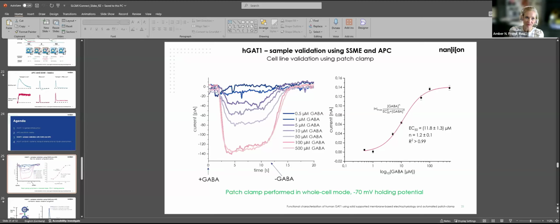I didn't show it here, but I also performed the stoichiometry assay with chloride. But in my hands, it doesn't look like chloride is thermodynamically coupled. In past experiments, it has been shown that if you are in complete absence of chloride inside the vesicle, then you can clearly see a coupled transport of chloride.